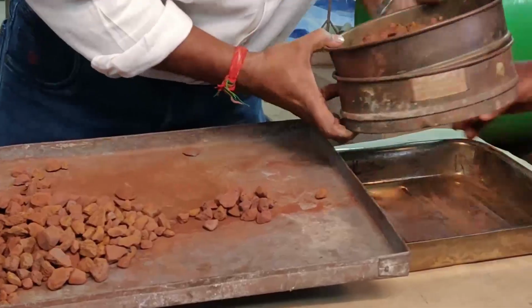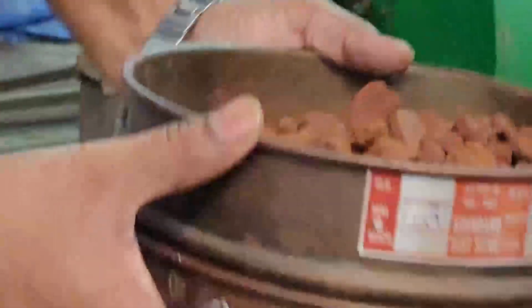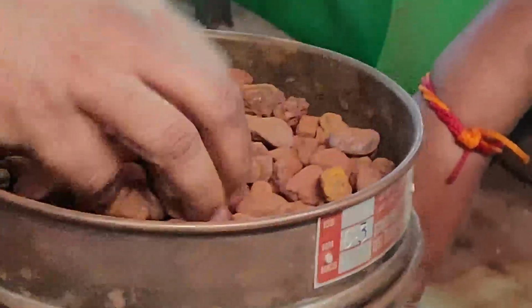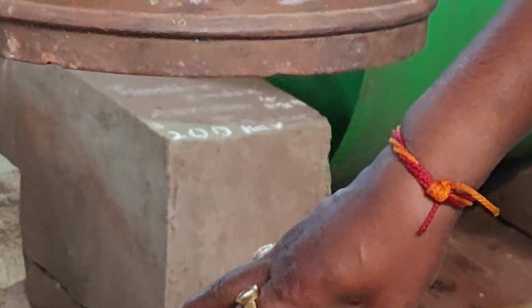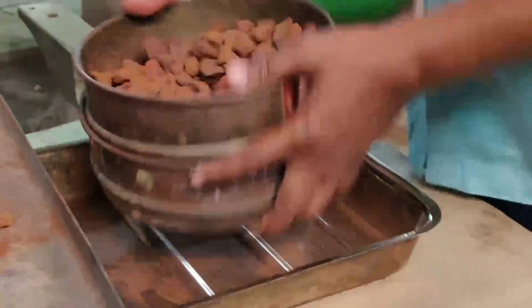You can see a 0.5 mm screen and this one is 6.3 mm. We want to separate the plus 6.3 and minus 0.5 mm. The plus 6.3 material is retained here, and the material passing through 0.5, that is the minus 0.5 material, will be collected in this tray. For these two fractions we need to calculate the abrasion index and tumbler index.